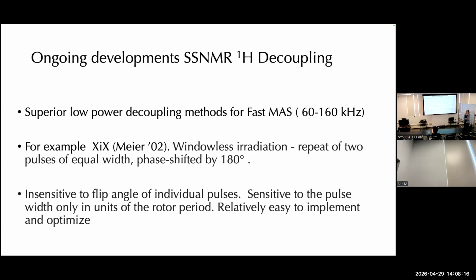And let's say we were on a 900 and we want to cover 20 ppm. That's almost 20 kilohertz. We cover. So yes. Similar kind of thinking comes up where it's not going to be CW, but you're going to have shorter pulse elements inside.